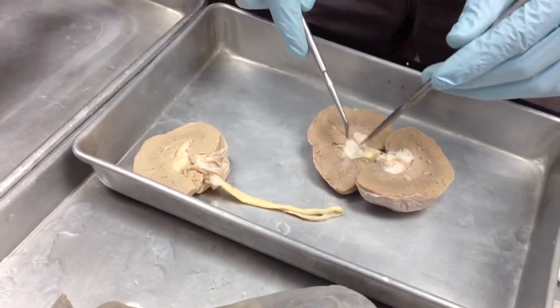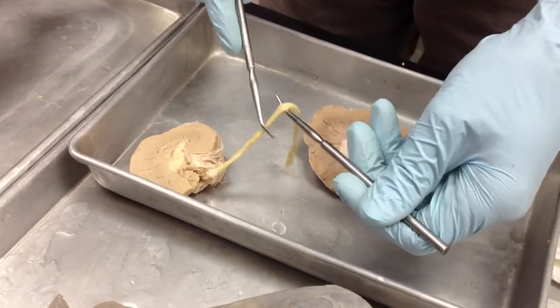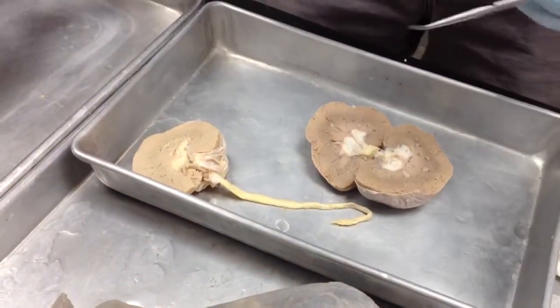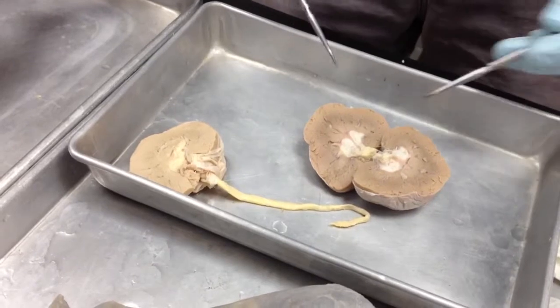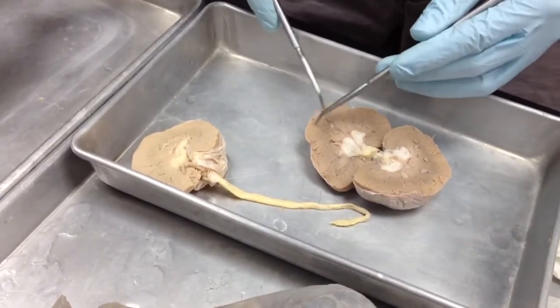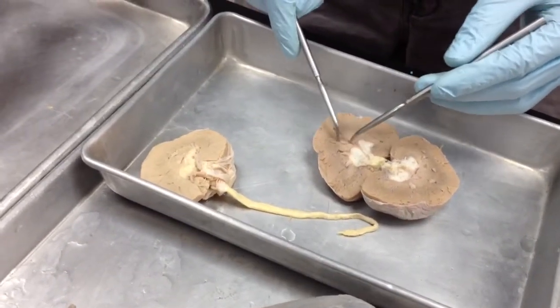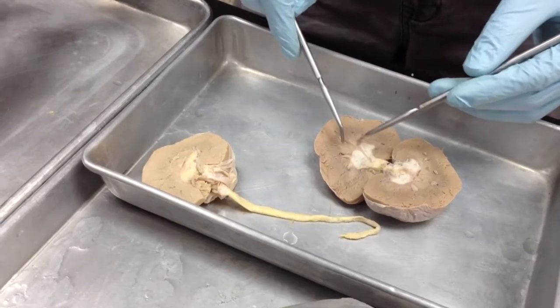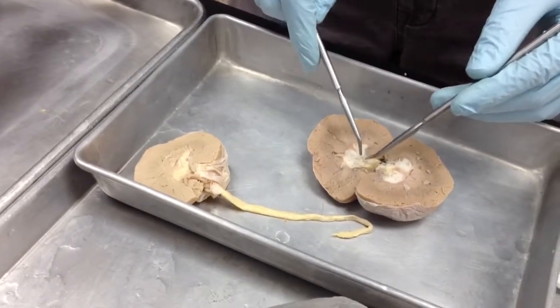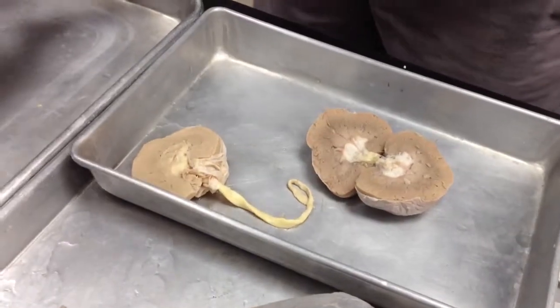After that, they collect in this area, and eventually enter the ureter. So that's just urine formation, basically. A very, very coarse description of it. The majority of your blood filtration is going to be right here. Your urine formation is going to be right here, and eventually it's going to enter into your ureter right there around the pelvis area. And it goes down to your urinary bladder.